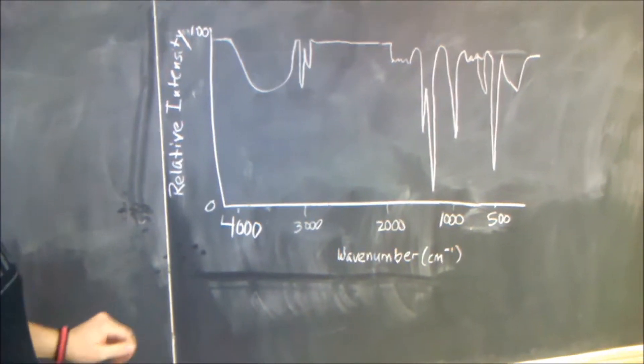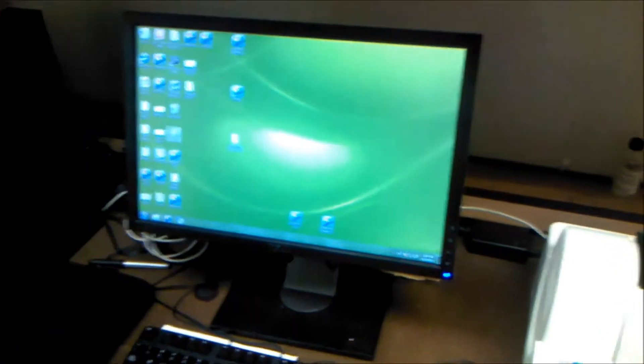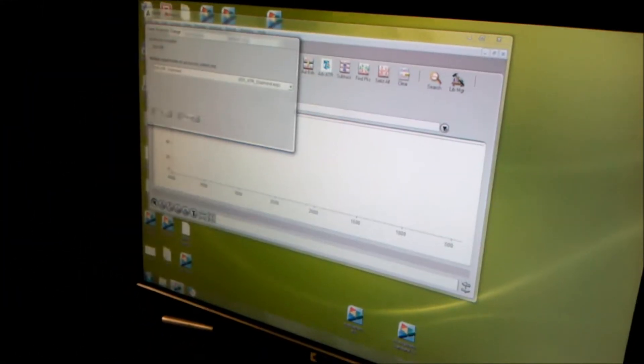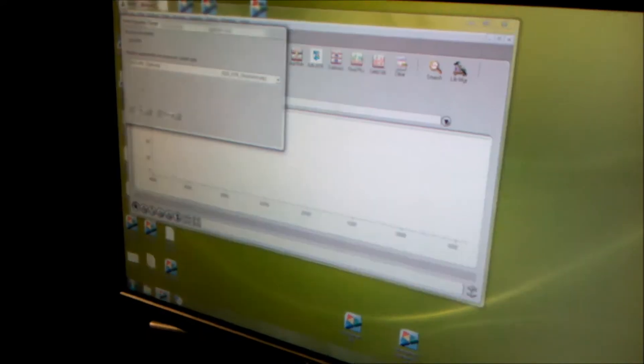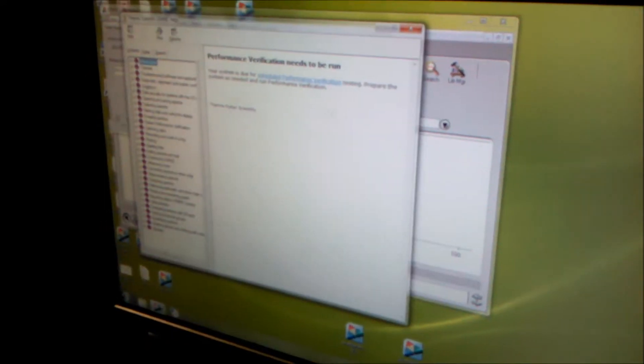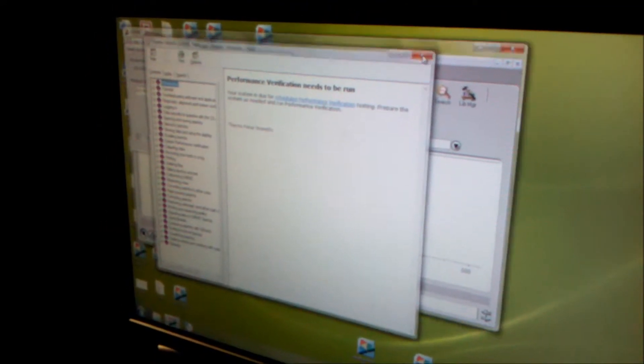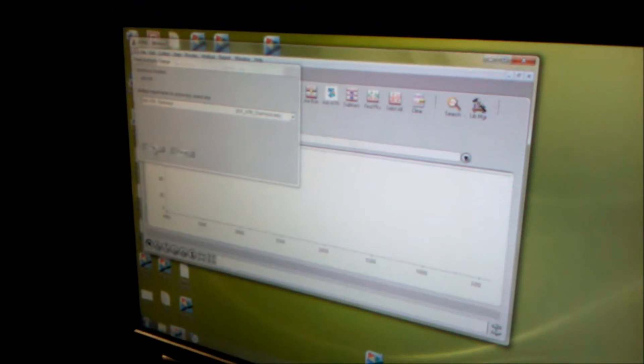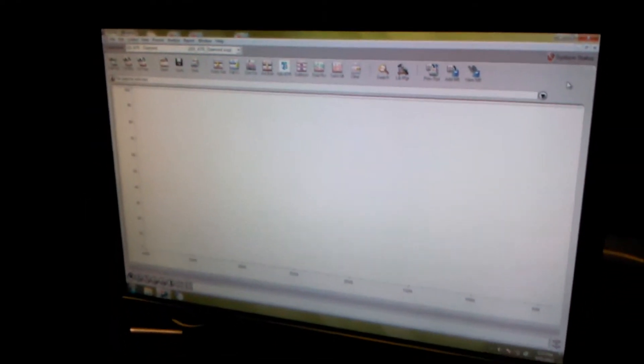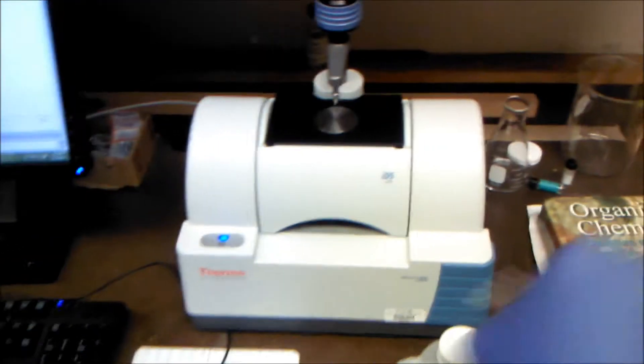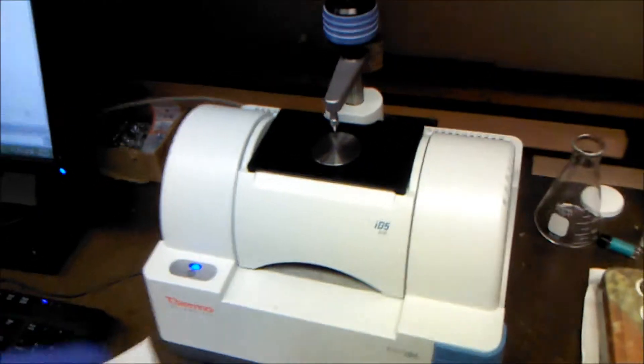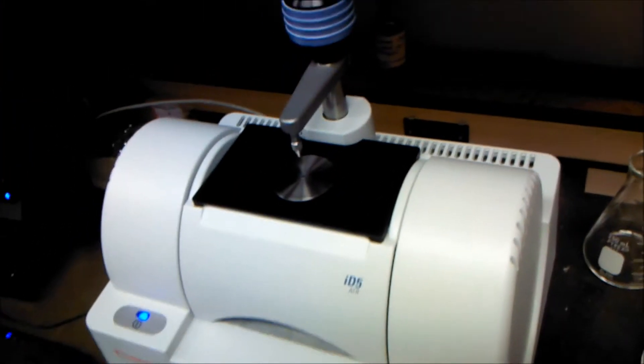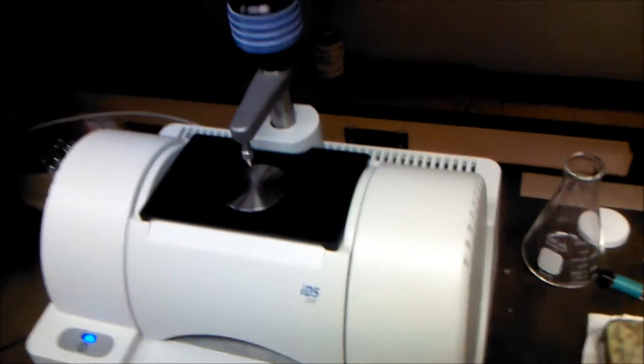To use the IR machine, first you want to open the program, it's OMNIC. Exit out of the help and then press OK. We'll enlarge it to get a better view. Now, before you collect anything, you want to make sure that your colleagues have cleaned off the apparatus correctly.